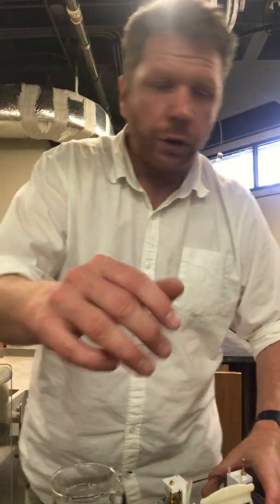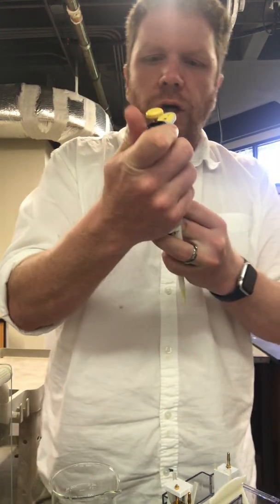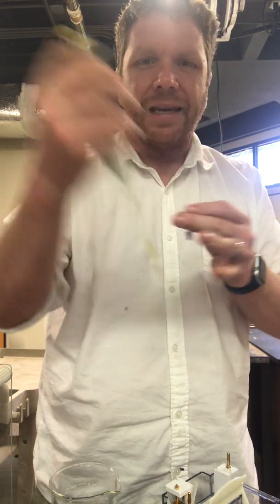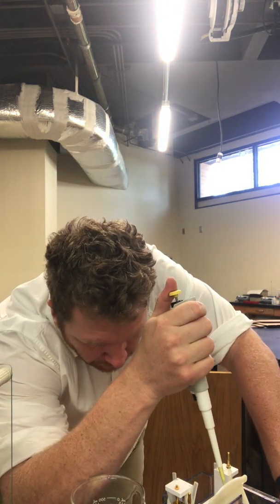Now I'm going to load my first sample. My first sample, as it would be, is my protein ladder. So I'm going to adjust my pipette to 7 microliters. I'm going to get 7 microliters of my molecular weight standards and load this into the well that is farthest to the left in my gel. It's tough to see, but right about there. You can see that protein has landed into that well. I'll be back.